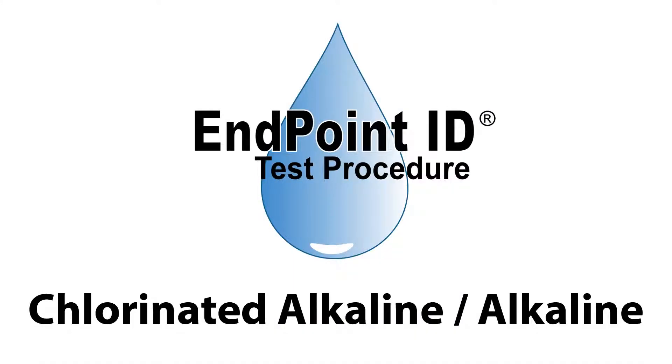This is a demonstration of the Chlorinated Alkaline or Alkaline Series Drop Count Test Kit using Endpoint ID procedures. Please refer to the appropriate Endpoint ID Plus instruction sheet while watching this training video.